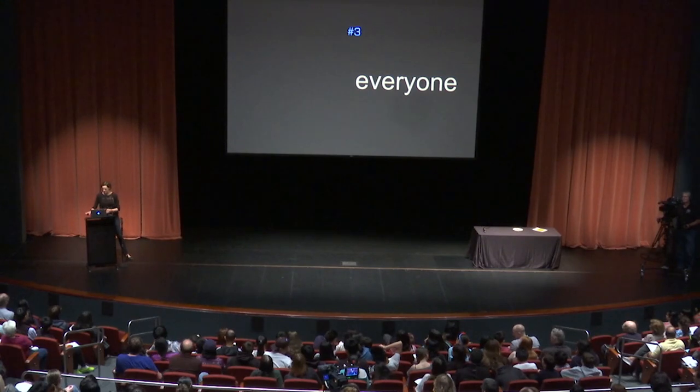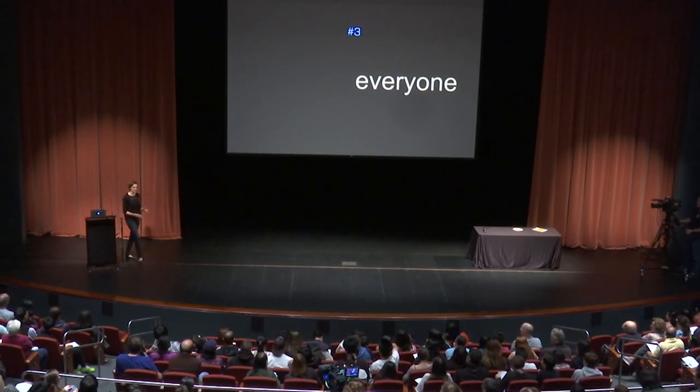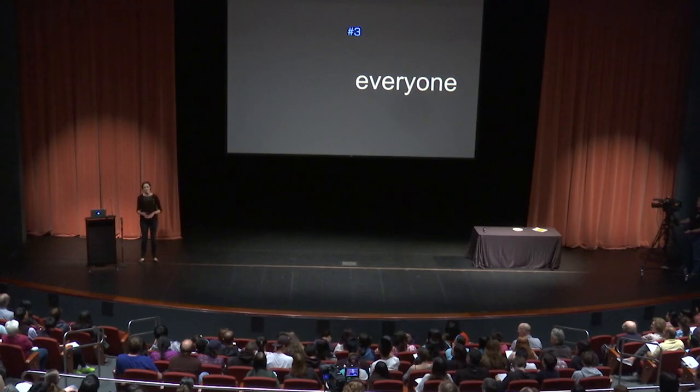Okay, so from that demo, we learned two things. First of all, we can get different types of signals, whether we're recording from a single neuron or from a whole group of neurons. And secondly, why do we even record from the neurons in the first place? It's because depending on what we hear or what we record, we can make an educated guess about what caused that signal in the first place or what stimulated it. Okay, so now finally I'm going to hand it off to Monica, and she's going to tell you how we're going to take these different tissue models into the next dimension.